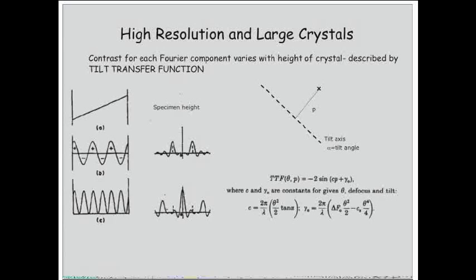It's a function of this distance, the resolution theta, and defocus. So it looks a little bit like a contrast transfer function, but it's got additional components that you need to apply to correct and restore this central peak in the split spot.